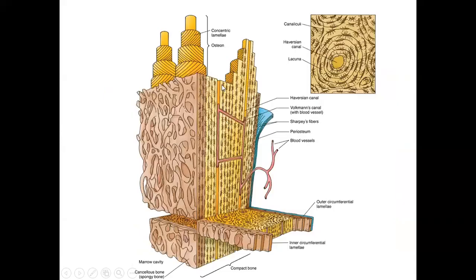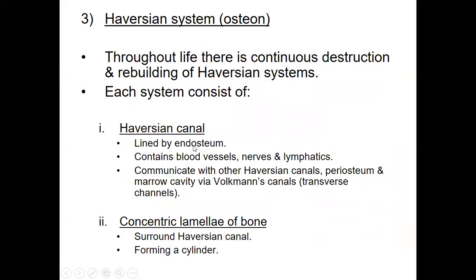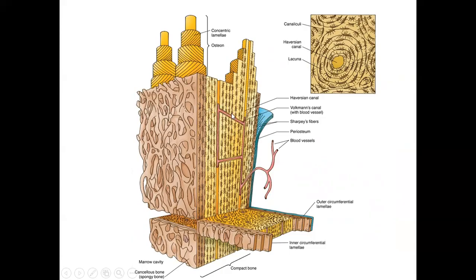So this is a Haversian canal, and this is another Haversian canal. This Haversian canal communicates with the other one via Volkmann's canal, the transverse canal here.